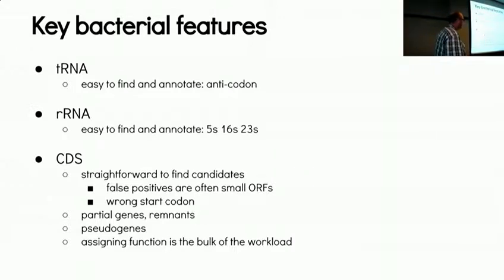The other problem we have is that when genome assemblies are not complete, our contigs get broken into pieces, and then you can have genes that are broken. So you might not be able to find a completely intact gene because of these contig breaks. Pseudogenes are genes that are broken for real, in the organism.